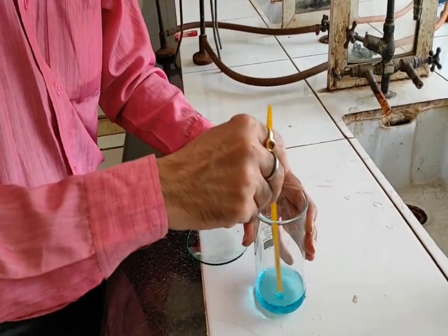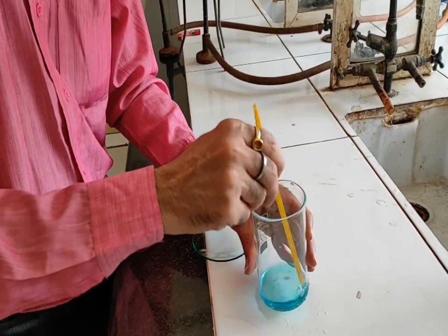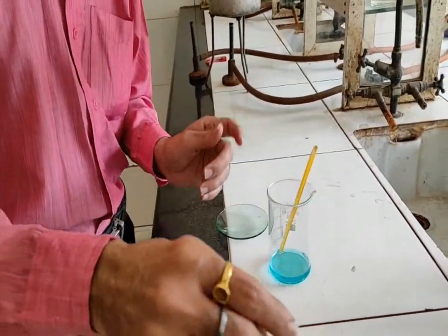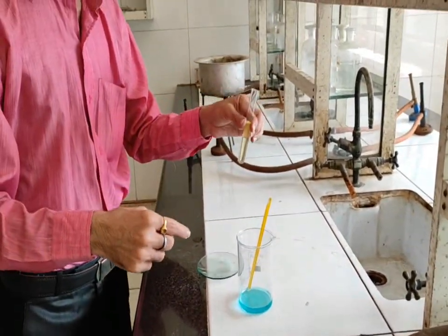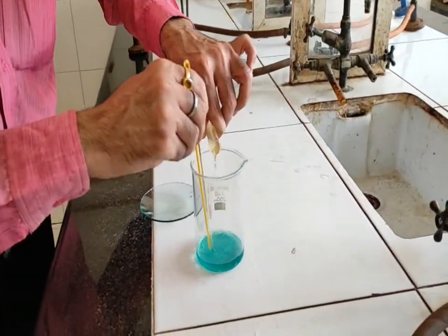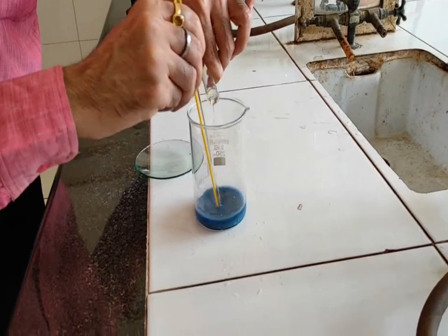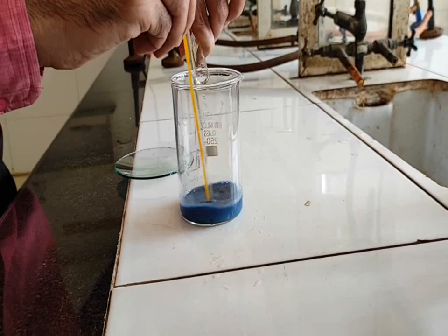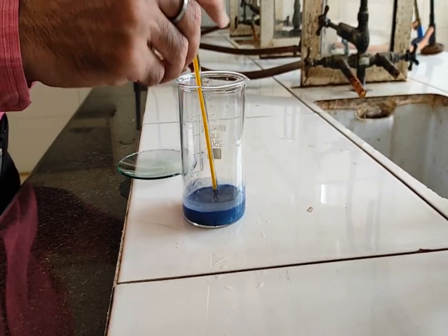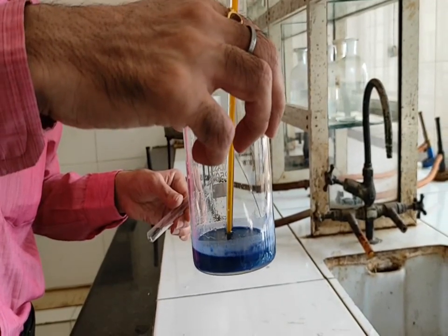Now, the next step: we have the metal ion solution. Complex formation always takes place by the interaction between a metal ion and the ligand. Now we have the ligand solution — acetylacetone in the presence of 1:4 ammonium hydroxide. Very slowly, carefully, drop by drop, with constant stirring, we are going to add it into the copper solution. Can you see now — it results in the formation of a blue color complex. This is bis-acetylacetonato-copper(2+). This is what complex formation looks like. Previously we had a clear solution, and on interaction with the ligand it results in the formation of a complex.